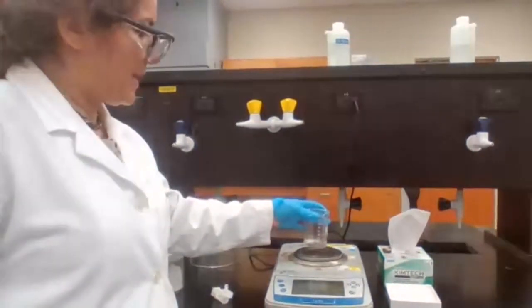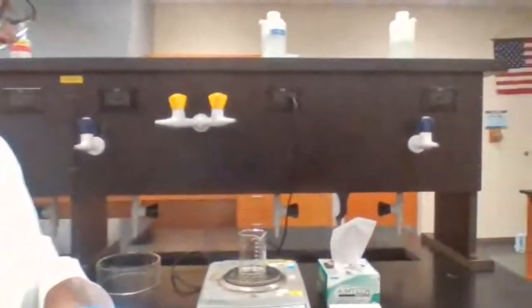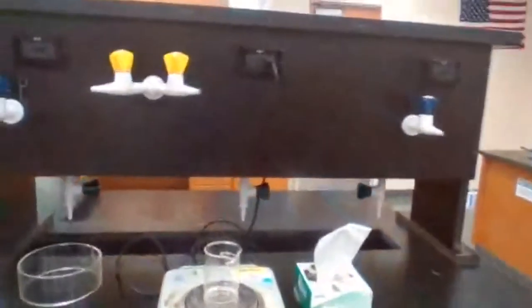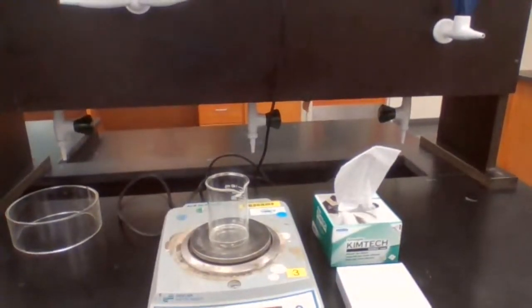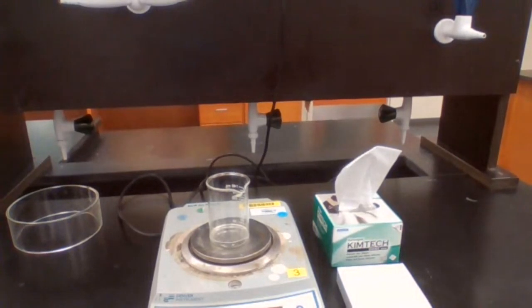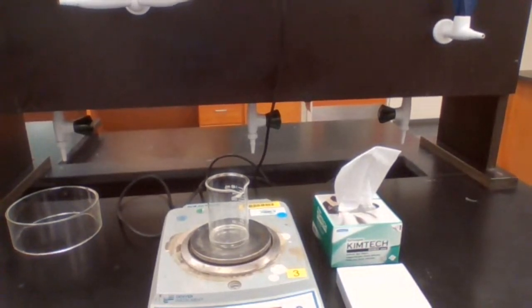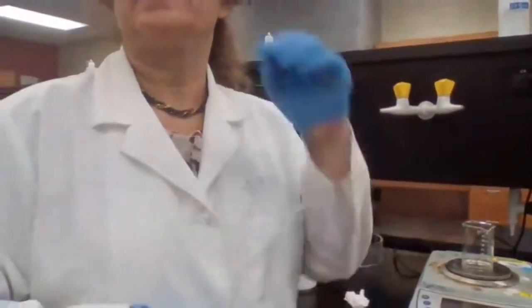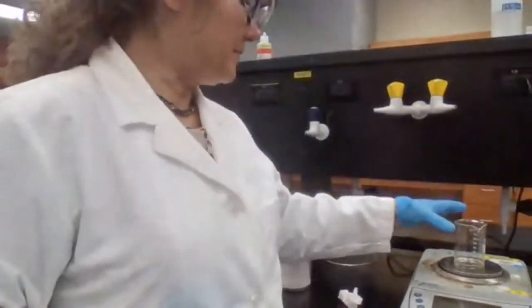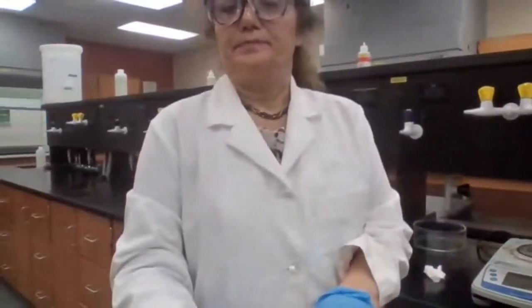Okay, measuring the mass of the product plus the sample plus the beaker is 78.240. Oops, moving. Okay, 78.240. You can record that for the mass. Yes. Sample plus the beaker. Okay. Any questions?